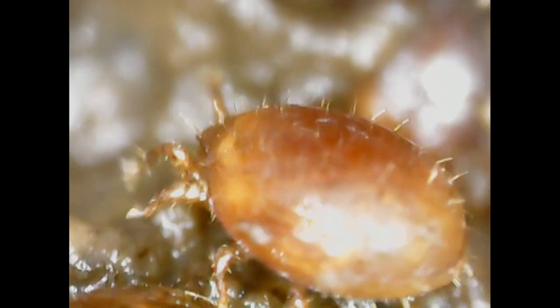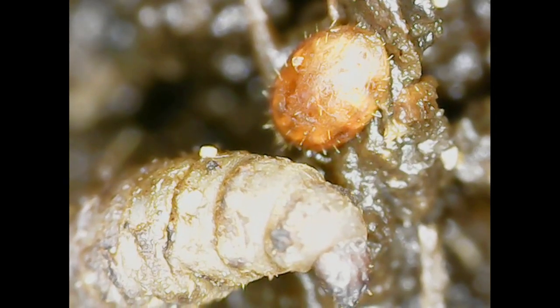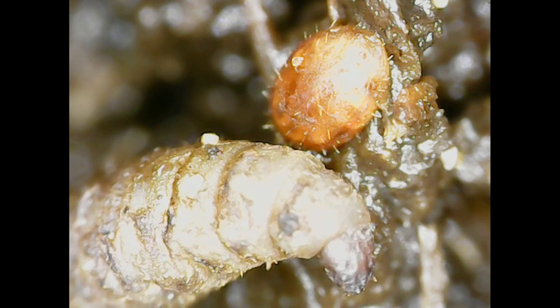Yeah, these mites are in every worm bin. I don't want to say every worm bin has these type of mites, but I imagine they do. There they go. Very cool. Back to a worm. Or something. Oh, there's a maggot. I did not see that. I only saw the round thing, which I don't know what that is.